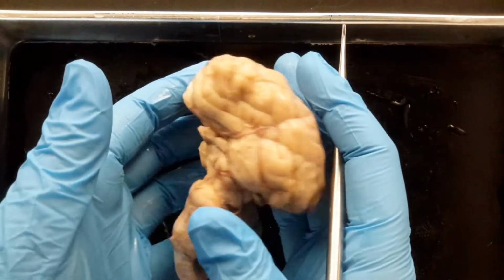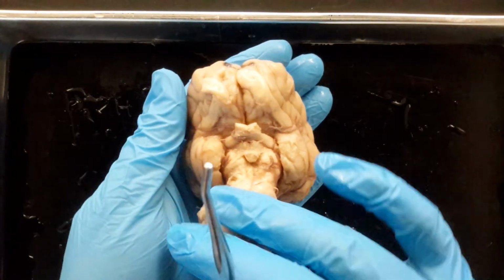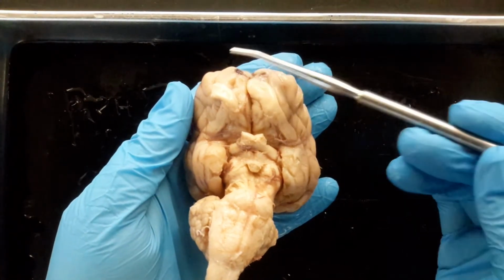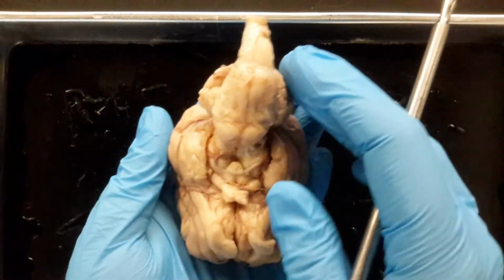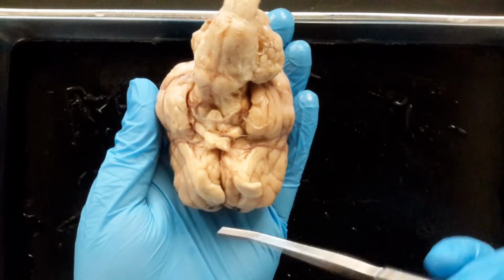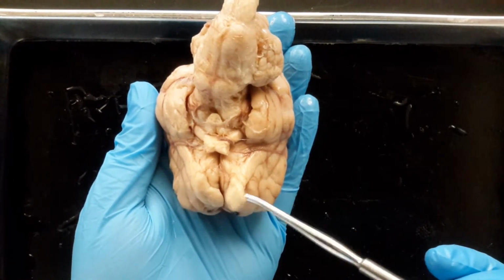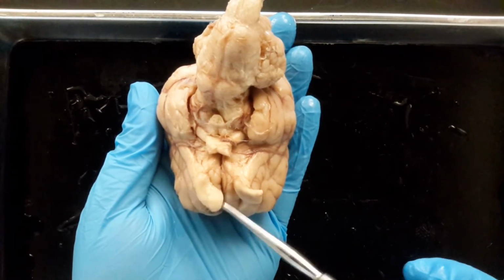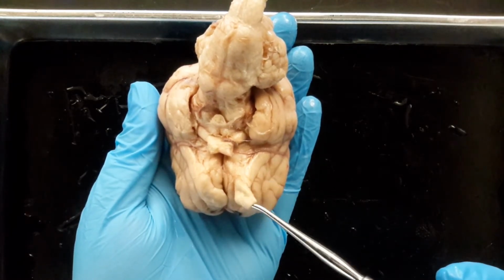Okay, so let's see. I'm going to turn the brain over. We're going to look at the inferior view to identify some structures real quick. So here is the frontal lobe. So this is anterior, the image is switched for me. Sorry. Okay. So this is the anterior portion, so frontal lobe. Sitting at the base of the inferior portion of the frontal lobe are these little white tracts. This is the olfactory bulb.